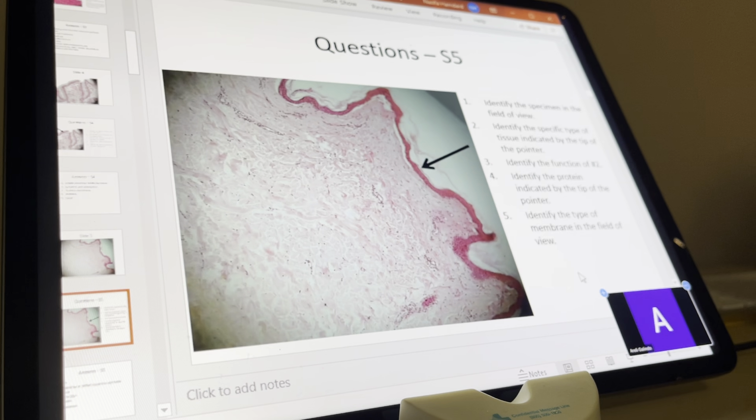Specific type. Is that either 3 of them? Oh, no, wait, I'm talking about membranes. Yeah, that's going to be the general type, but this is the specific type of tissue. So this is something epithelial tissue. Oh, I literally just said this. Keratinized, stratified, squamous epithelial tissue. Yeah, exactly. Perfect, because that's the only one that's going to be the skin.